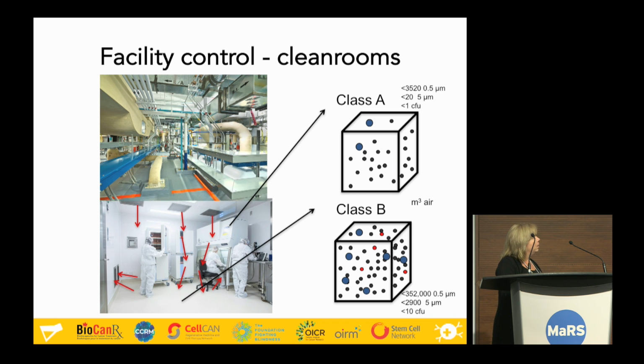And so when we're doing critical processes, we're constantly monitoring those particles, and we're using touch plates or contact plates of media, and we're testing the people, the floor, the equipment to make sure that we're not growing anything in there where we're not supposed to.